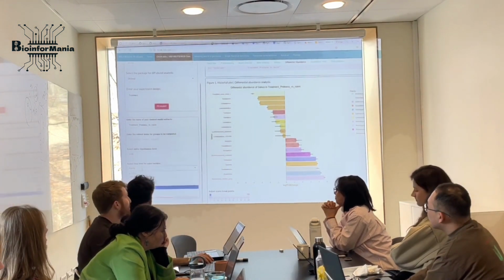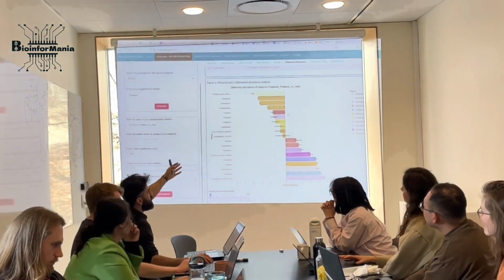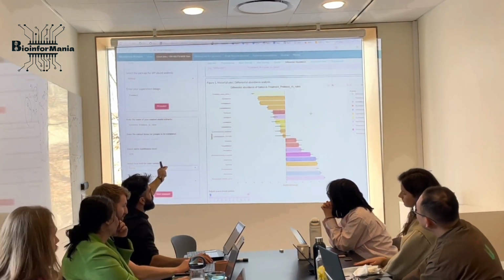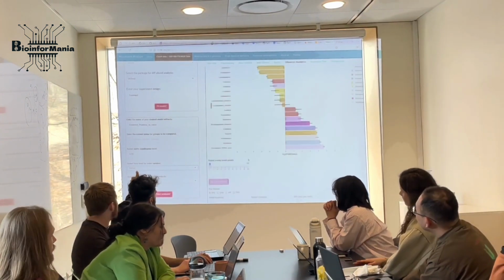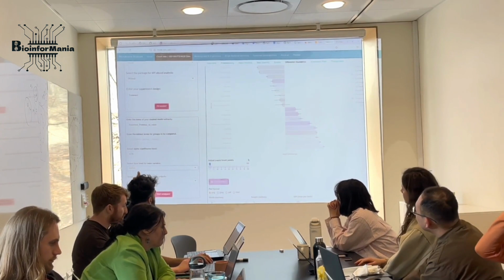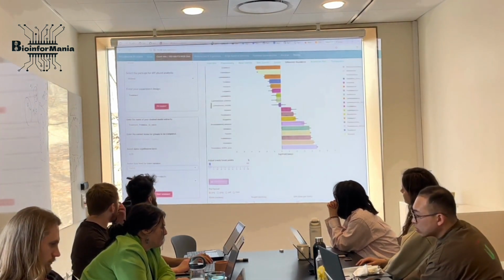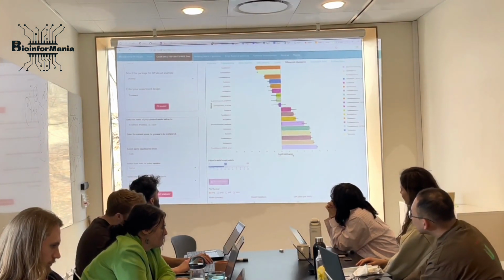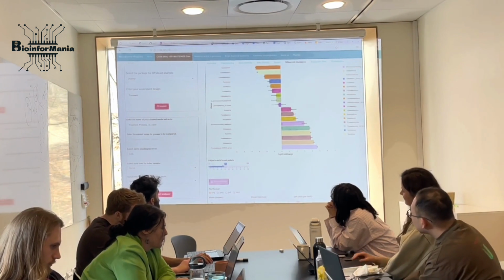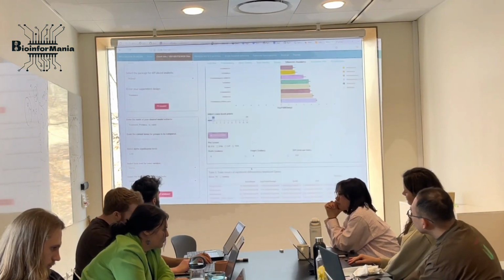And then here you can also paint it with other, how do you call it, lower taxonomy levels, okay? You don't have to do that. And then you can also increase this tick number or decrease it, but just stick to the default. If it's too condensed, you can make it a little lower or less. Anyway, it doesn't respond.